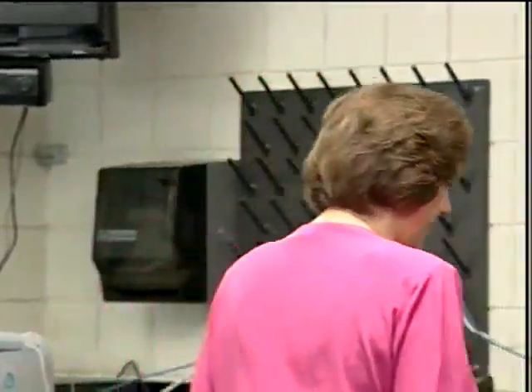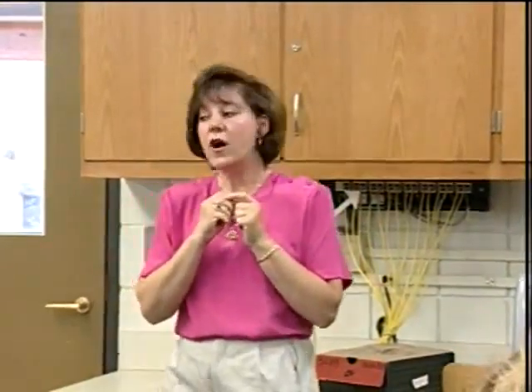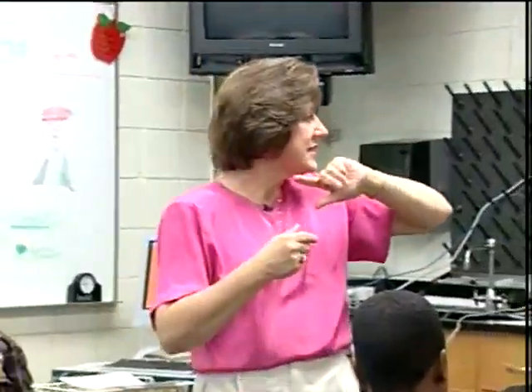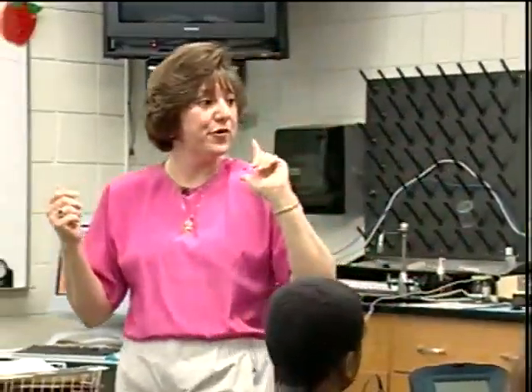How do we calibrate? How do you think we might calibrate pH? We've done this with temperature, but now how would we do it with pH? Do you have an idea? Go to eCalibrate. All right, we go to eCalibrate, exactly. We go into the eCalibrate program. Then what else do we do? Esther? Go to Setup. We go to Setup, okay, or else we're going to set up for our new Calibrate program. But what else?